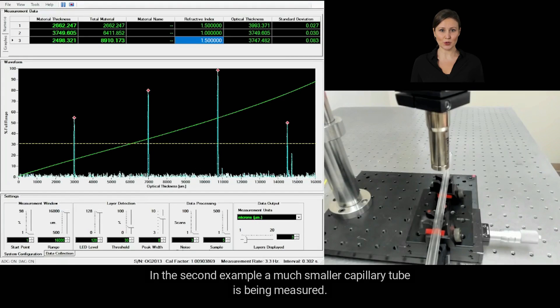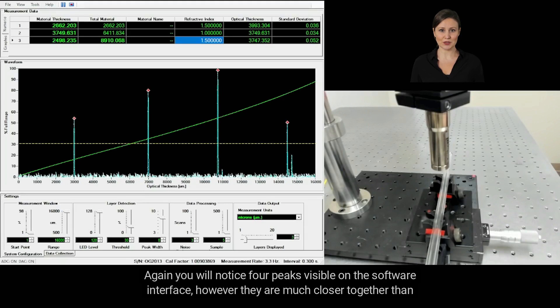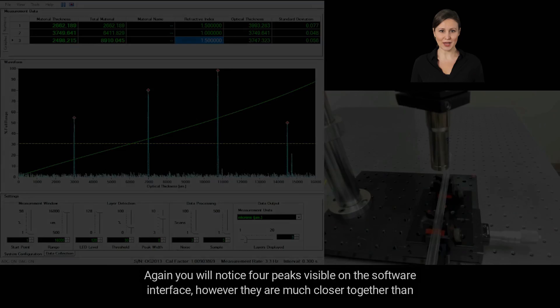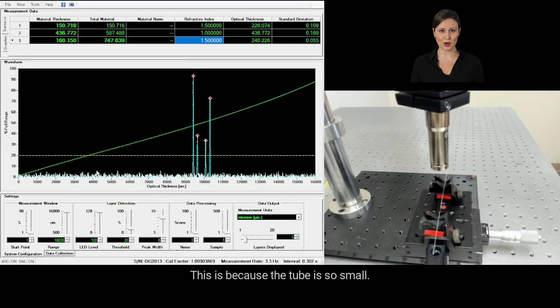In the second example, a much smaller capillary tube is being measured. Again, you will notice four peaks visible on the software interface. However, they are much closer together than the previous example. This is because the tube is so small.